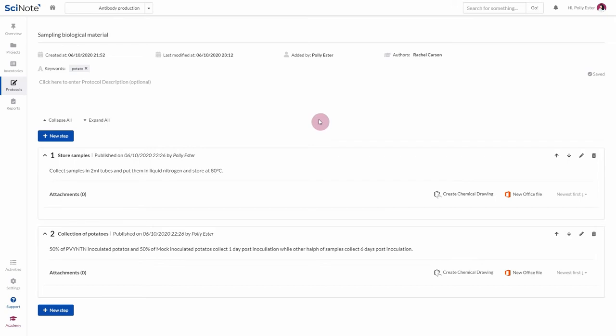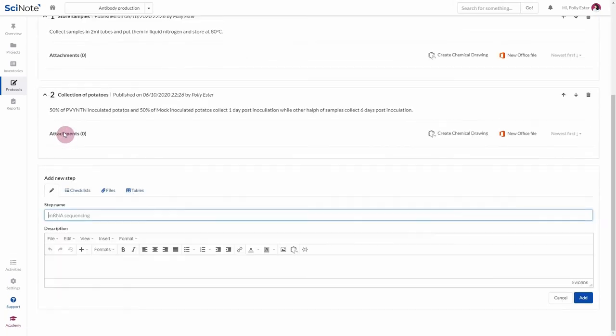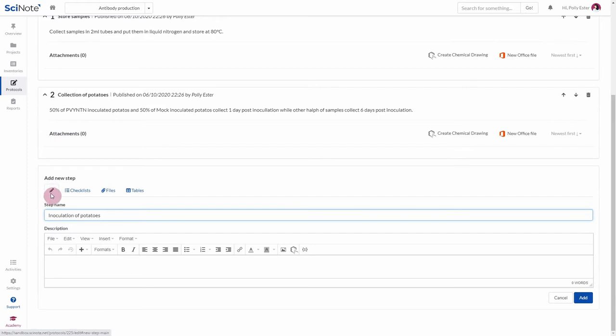To create a new step, click the blue button New Step. Every step needs to have a name. The rest is optional. You can choose between four types of content to add to a step: Text, Checklists, Files and Tables.